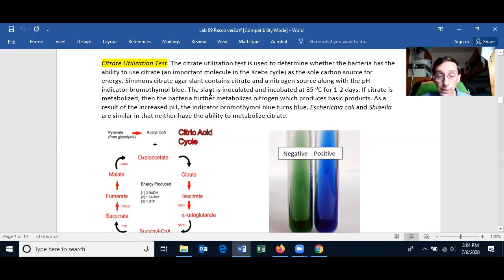This tube, you won't have to worry too much about it because you'll be doing it virtually, but you can introduce a carbon source if you put too many bacteria on the tube, meaning you culture too many bacteria. So this tube should be slightly cultured, like with an inoculating needle, and you only put a little bit of bacteria on the tube, because the bacteria can utilize the carbon from a ton of bacteria if you put it on there.